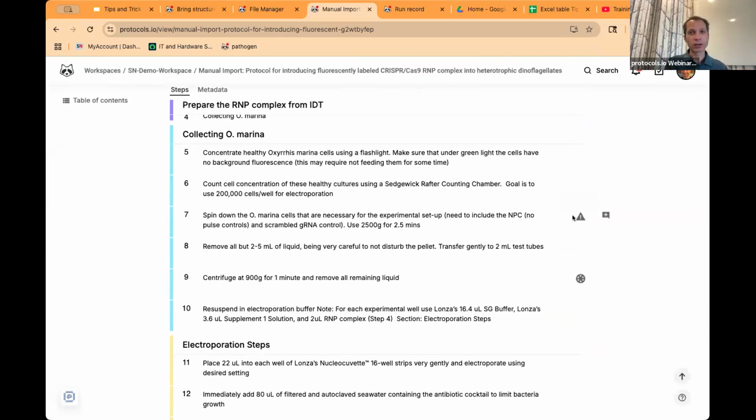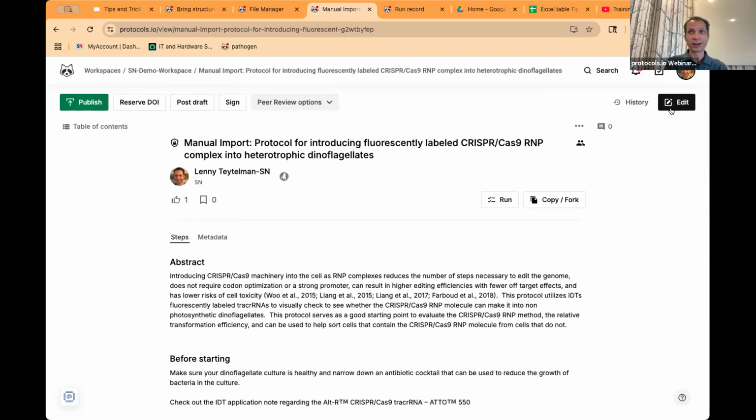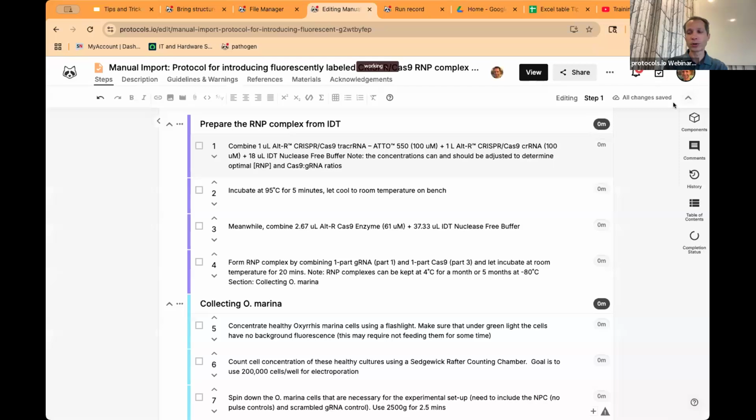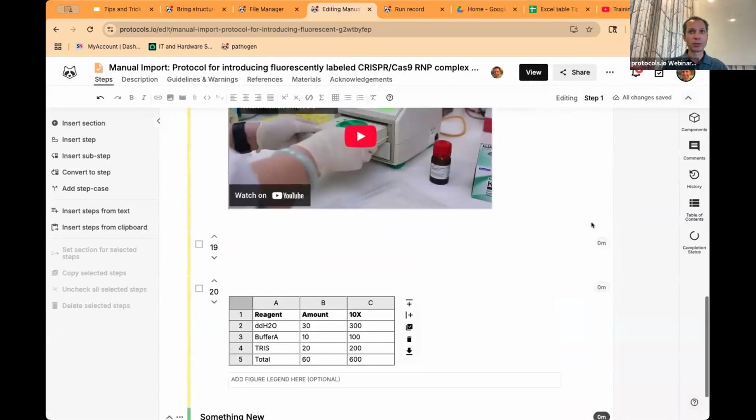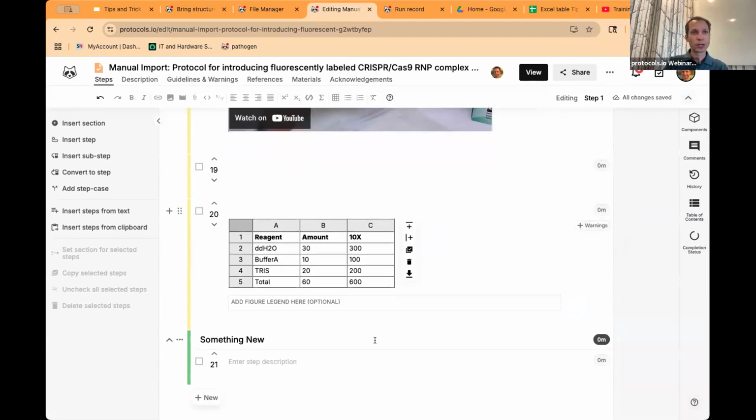So as you're quickly running through the protocol, it gives you, or other users of the protocol who you're sharing with, a visual marker of what that step is without necessarily reading the text. So it's good for something that you're running over and over. Again, you might not need the text, but those visual markers are nice to add.